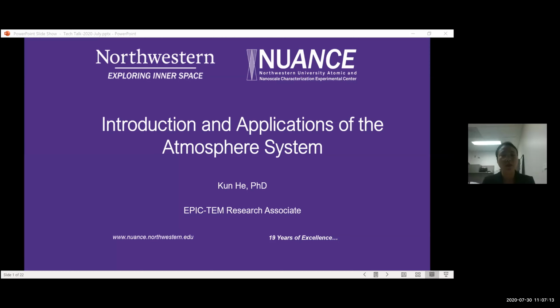I'm a research associate of the Nuance EPIC Center. I'm mainly working on the in situ work of the TEMs, including liquid, gas, and heating. Today, I want to introduce the atmosphere system in our EPIC Center and its applications.